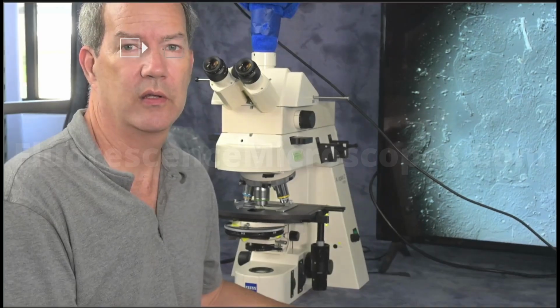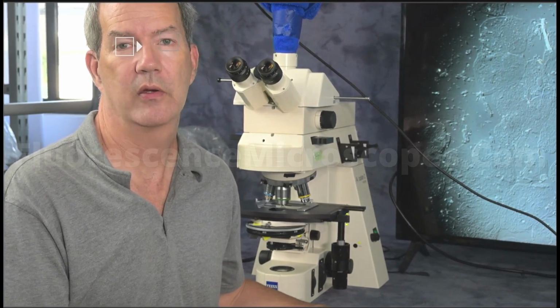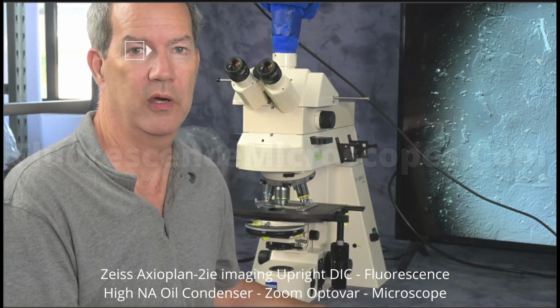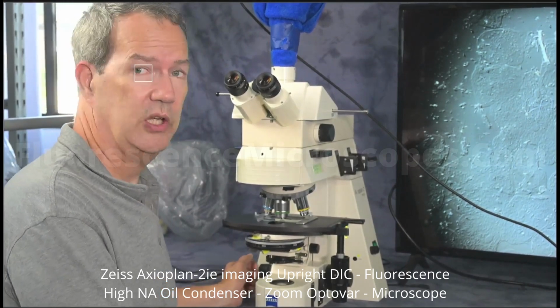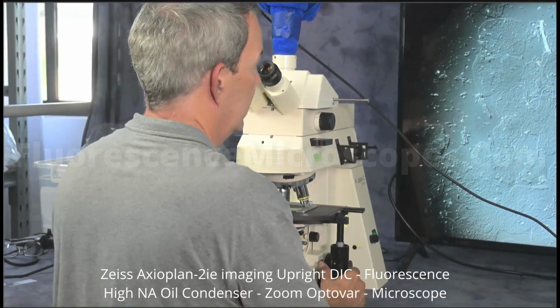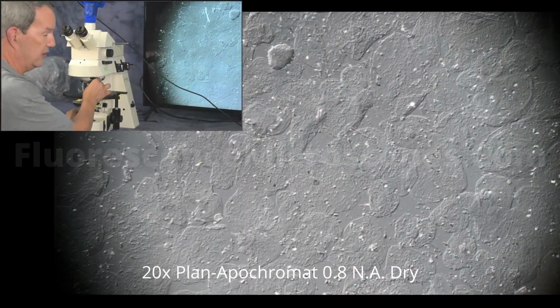So today we're going to look at a 20 power Plan-Apochromat with a high numerical aperture of 0.8, but that's a dry. So that's still a high numerical aperture for a dry, especially for a 20 power objective. We're looking at some cheek cells. We've just taken a swab and we're getting an image of those, and it's on DIC.